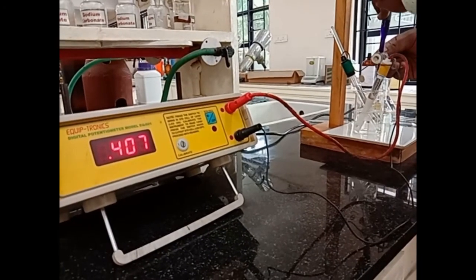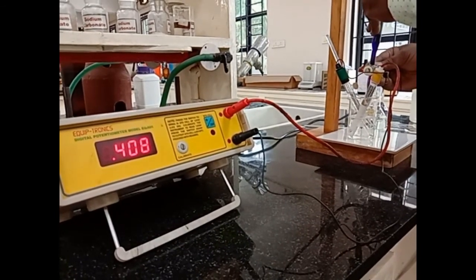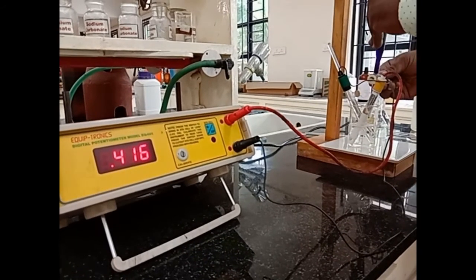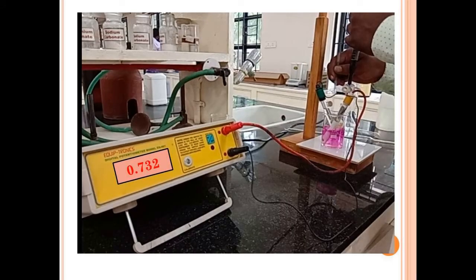And add 0.2 ml portions of KMnO4 from the burette and the change in the EMF is recorded. We observe that the EMF increases slowly at the beginning and at the end point it increases suddenly.